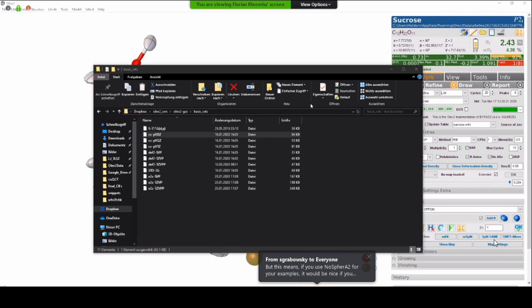Georg asked, what are the signs that you have reached the limits of your data, meaning that it is not reasonable to use an aspherical model? In principle, if you don't include the anisotropic motion on the hydrogen atoms, the number of parameters is the same as in the IAM.